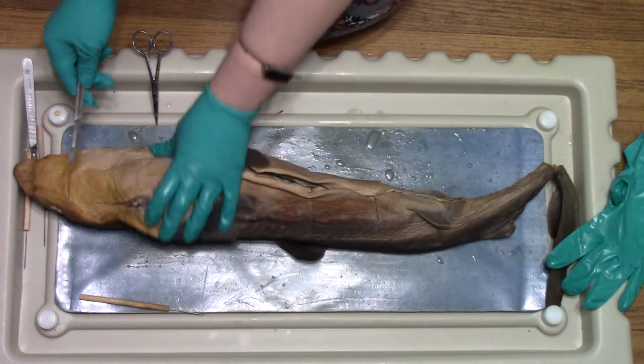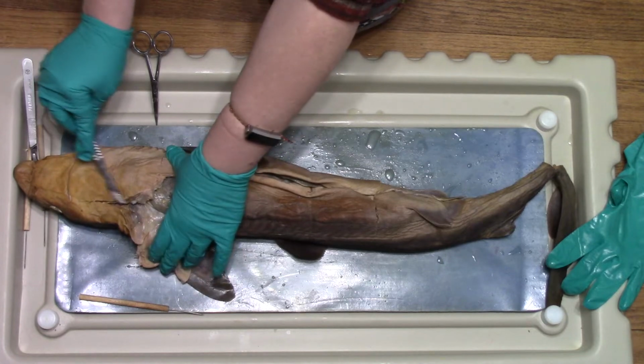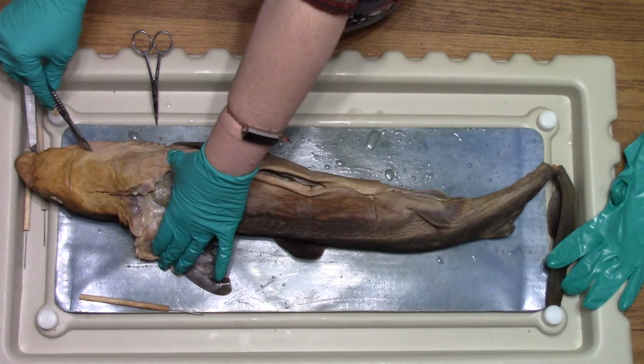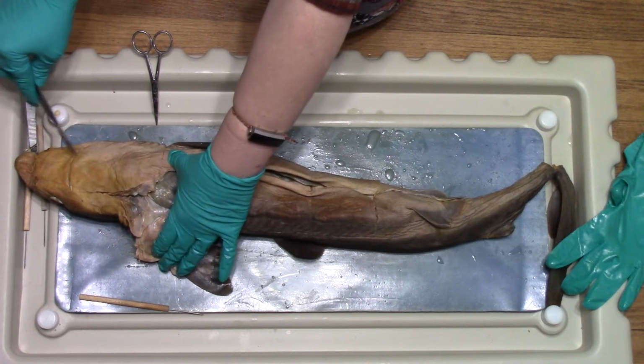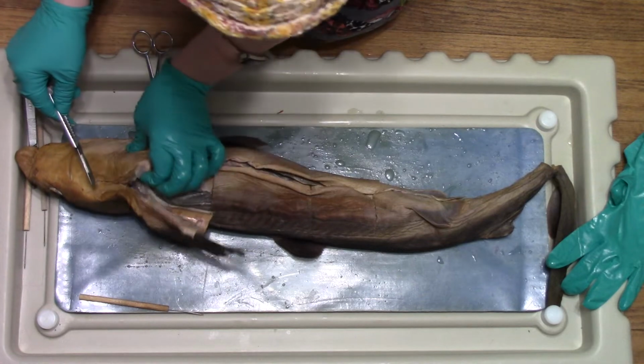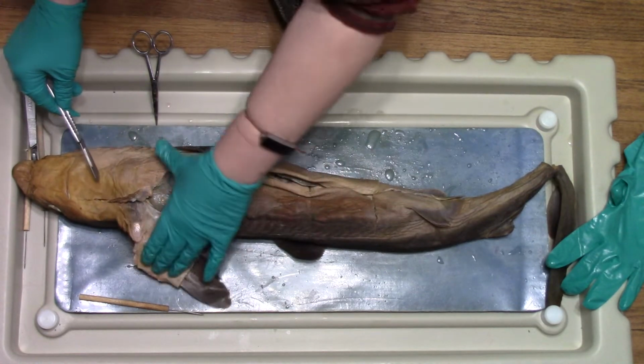In some textbooks, like our lab manual, it just says to do this one cut and then flip this all open, but in others they cut on both sides and pull that whole piece out. I'm not quite sure what the best move for us is currently.